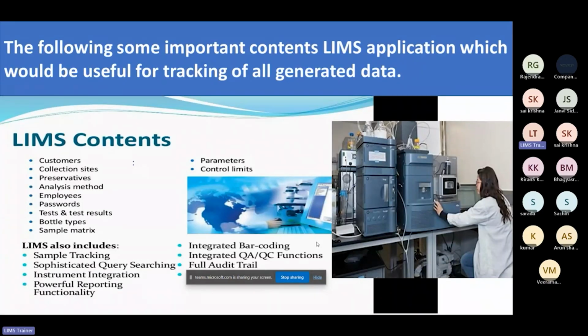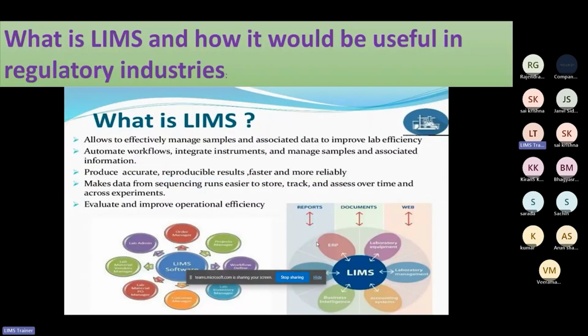Now let's proceed. So I was up to here, LIMS content. I have explained the basics of why LIMS is important in the laboratory. You all have understood that? Yes, sir. Okay.